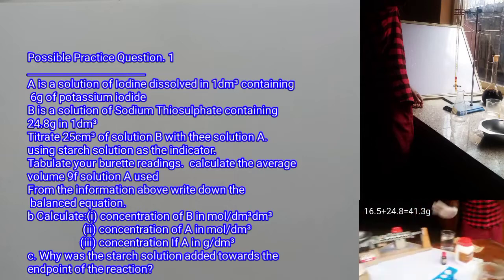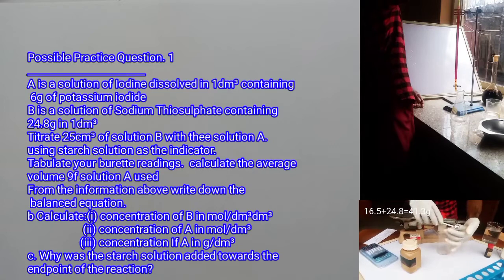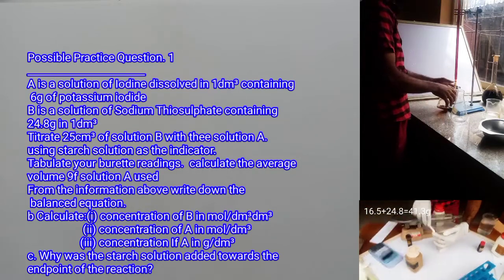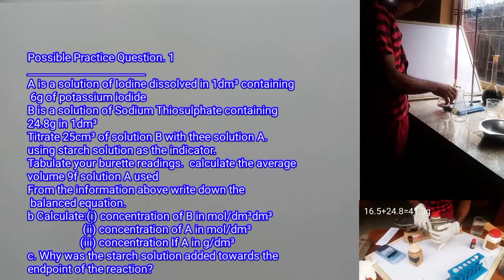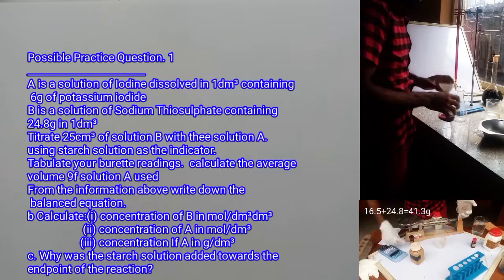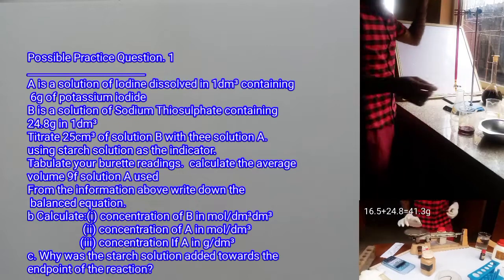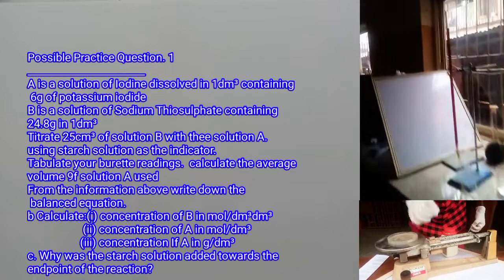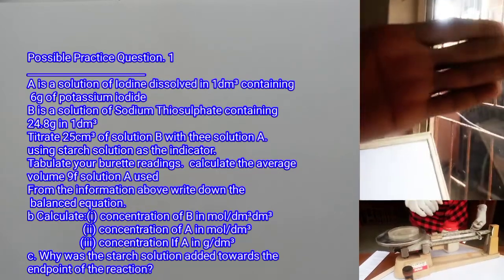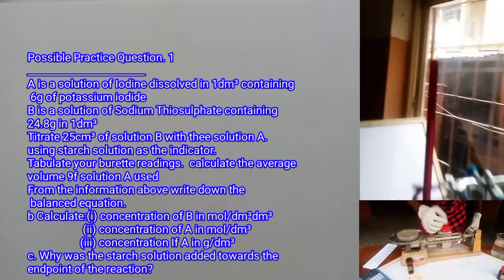Therefore, the first thing I need to do is to take the practicals, that is, do the titration. Okay, this is the opportunity for you to watch the titration once again. From the titration, we found out something here. I'm going to write down the values we saw in the titration. First of all, starting with the table.